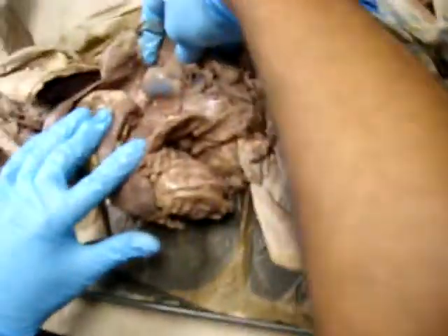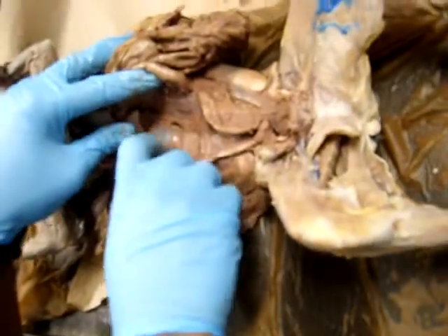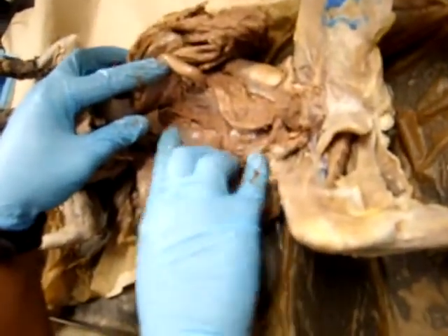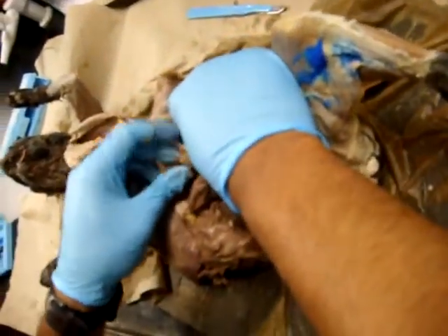That's a kidney of a cat. Okay. Here's the other side. Hold on. This would be the kidney of a cat, right? Well, I guess if you want, we can cut one open. No, we don't. We can cover the arteries too.